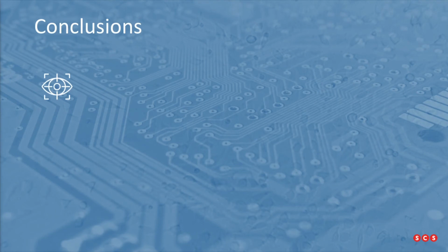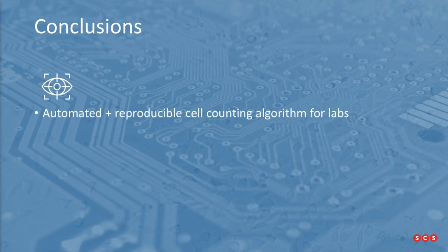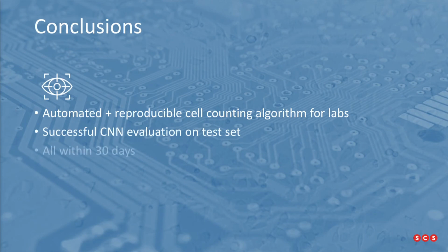With that, I'd like to conclude. We implemented an automated and reproducible cell counting algorithm for any lab. We evaluated our solution successfully on our test set. We did all that within 30 person days and 3 weeks total.